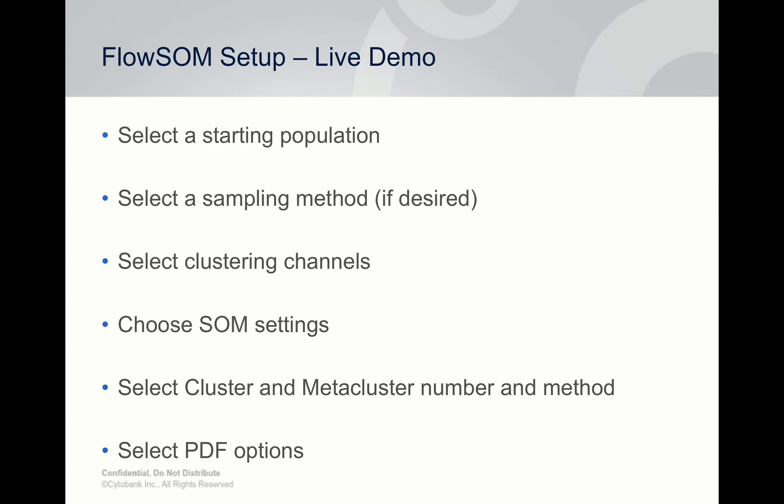After selecting a starting population, you choose a sampling method if needed — downsampling isn't required but is available for speed. Next, select the number of clustering channels, which follow similar rules to other algorithms. Then you choose the self-organizing map settings, select the cluster and meta-cluster numbers, and then select how you want to display the output.